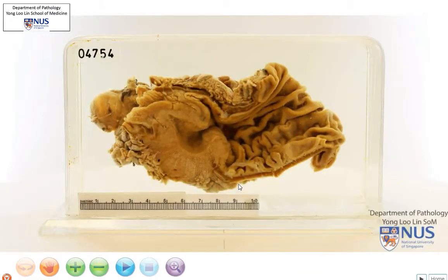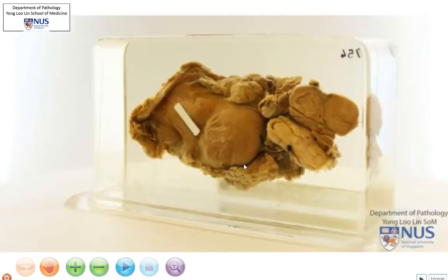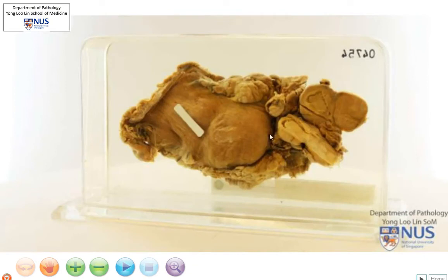To summarize: we have a fleshy ulcerating tumor at the gastric antrum with heaped-up overhanging edges. This tumor has invaded beyond the muscularis propria into the subserosa, and has also metastasized to the regional lymph nodes.